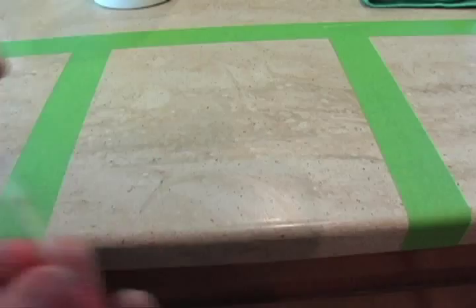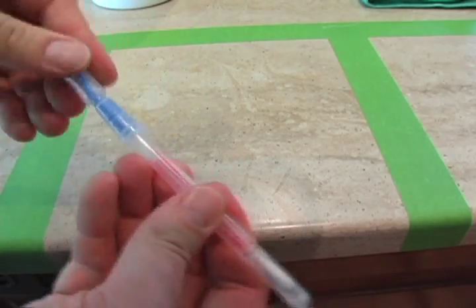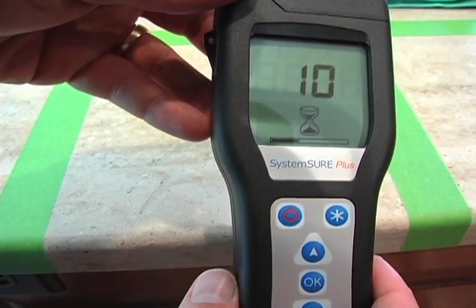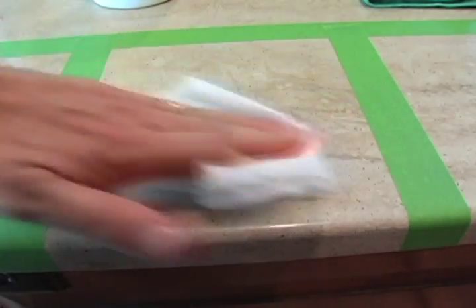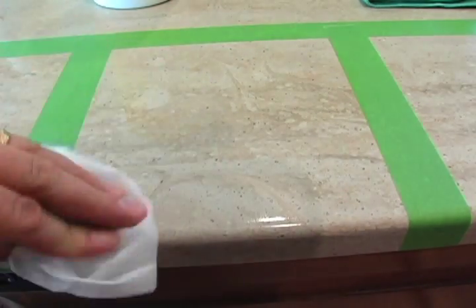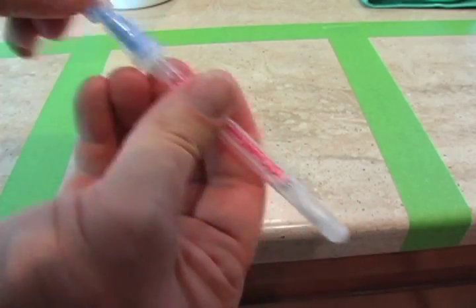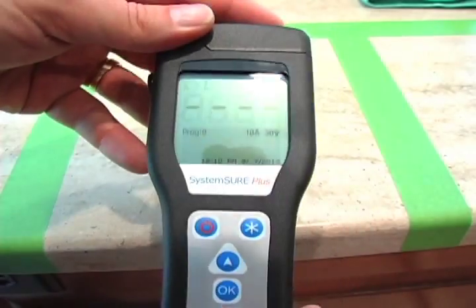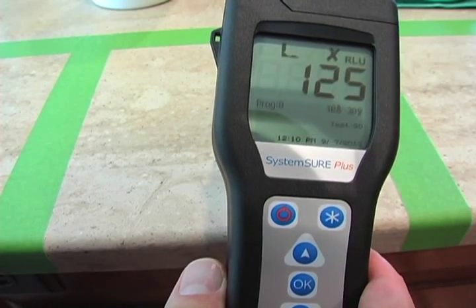Our third contestant is the Clorox sanitizing wipes. I first create the biofilm and test the area — placing the swab back into the tube, breaking the tip, squeezing the solution in, shaking it, placing it into the testing unit, closing the lid, and pressing OK. We get a pre-cleaning reading of 170. Then I wipe the area thoroughly with the Clorox wipes and run the testing process again. After waiting 15 seconds, we get a post-cleaning reading of 125, which is a major fail.